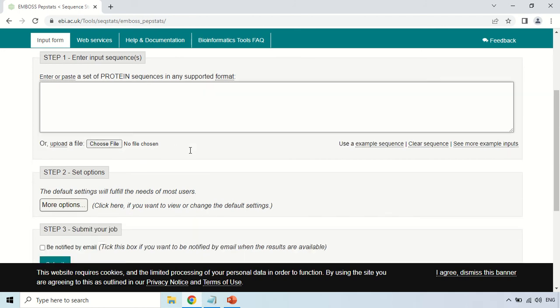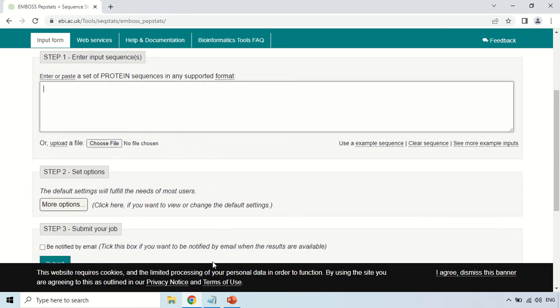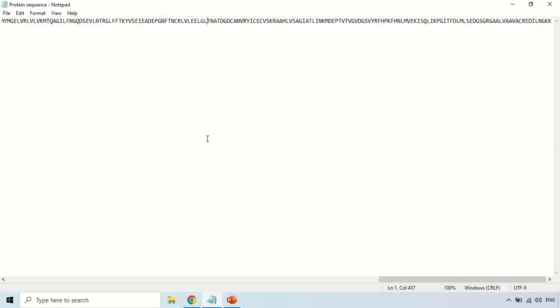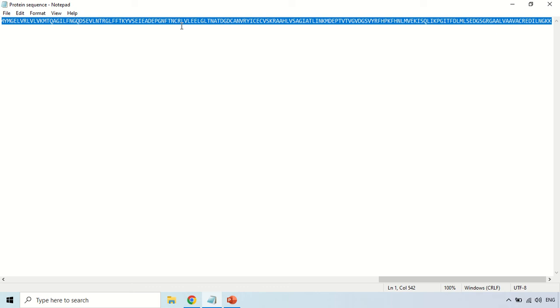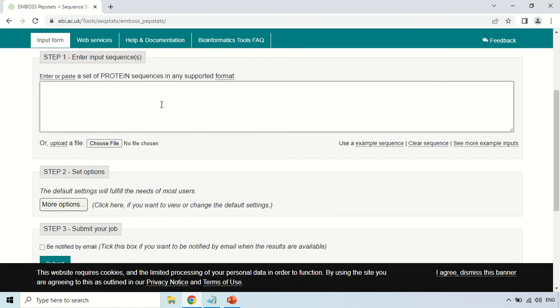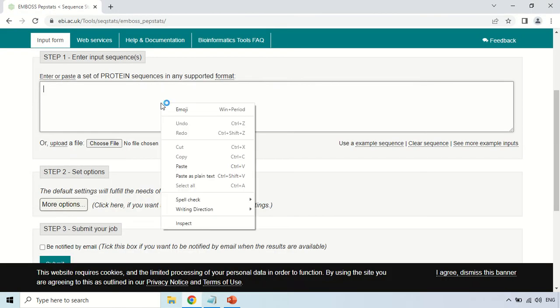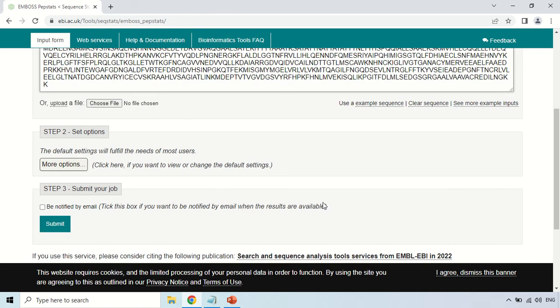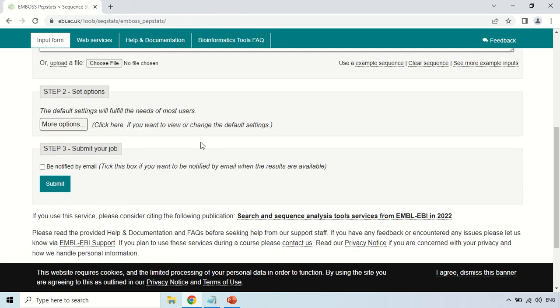Now I am just taking a protein sequence for example. This is the protein sequence, just copy your protein sequence and paste it in this window. Now after pasting, there are certain other options you may change. You may click this box to be notified by email, so the link of results will be emailed to you, but right now I am just skipping it.